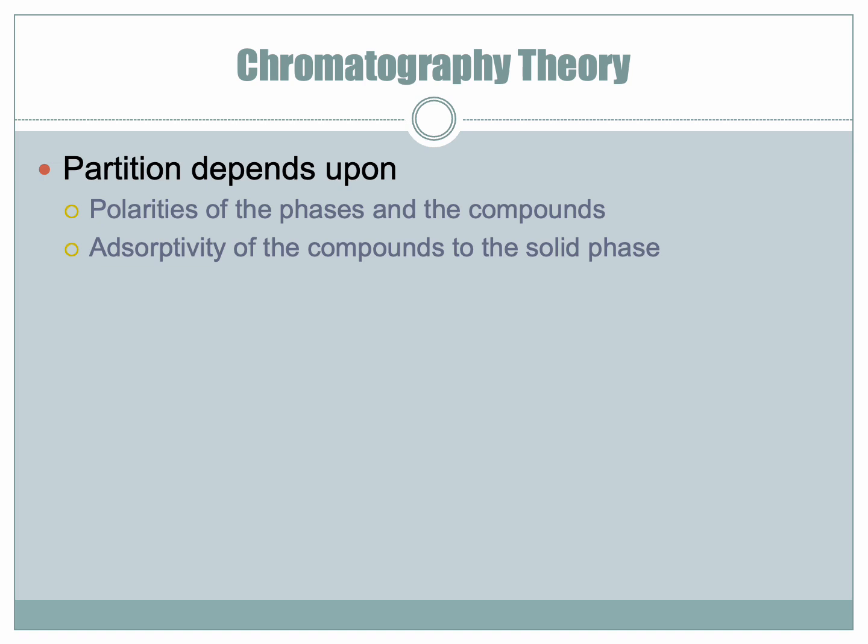So remember, this is like the partition coefficient, the time that each compound spends in each phase, whether it be aqueous or organic when we're talking about extraction. We can apply that same kind of idea to chromatography, except the compound, rather than moving between two different liquids, is moving between one liquid and one solid.